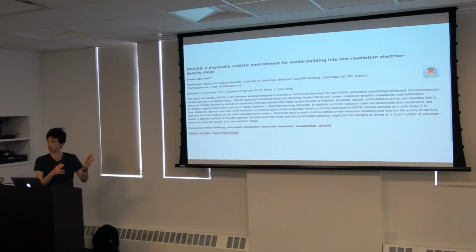This is more for taking that model and then rebuilding local regions that are misfolded, for example. I haven't really covered Rosetta because, to be honest, I've never been able to get it to run successfully on a timescale that I like for my particular problems. It works really well for some things. I just haven't had the experience with it to cover it.